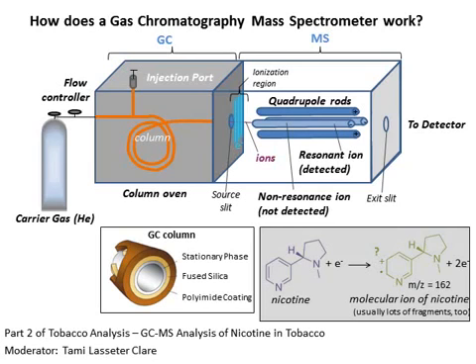So the first part of the GC is the injection port, which is attached to an oven. A sample is injected into a thin and very long column. The column is a glass capillary tube that is very narrow, so in the range of tenths of a millimeter, and very long, in the range of about 10 meters. And that is to allow sufficient separation of the mixture of molecules of interest.